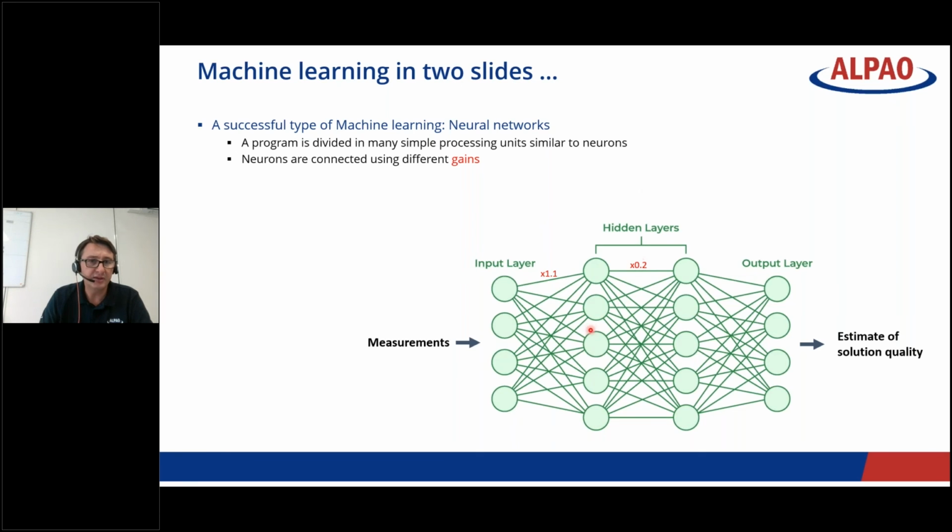And the key, you see in the picture, every green circle is a neuron. Of course you have to code this into your computer, but it's just the same small piece of code repeated a large number of times. They are all connected, so the input of one simple processing unit will be the output of the layer that is before.